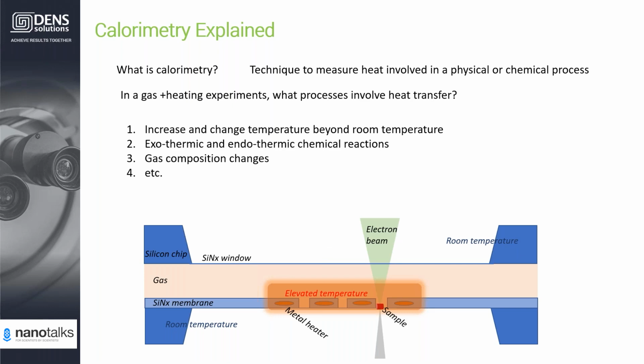Think about this scenario, like heating up water, vinegar, or some alcohols. Because their heat capacities are different, you need different heat energy to reach the same temperature. This is analogous to gas composition change.